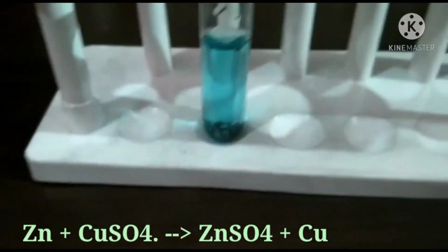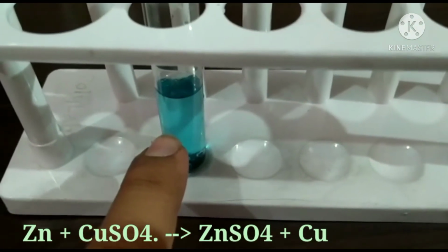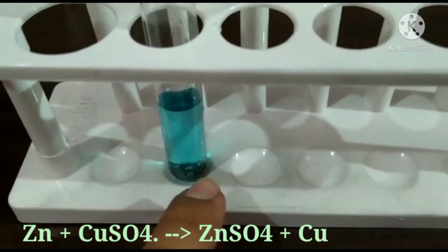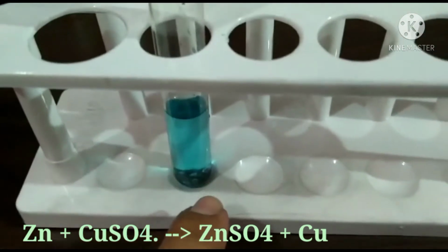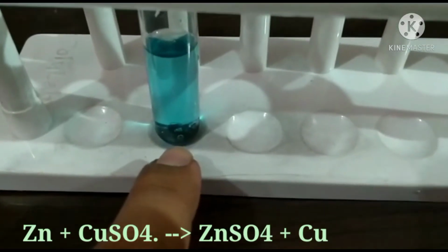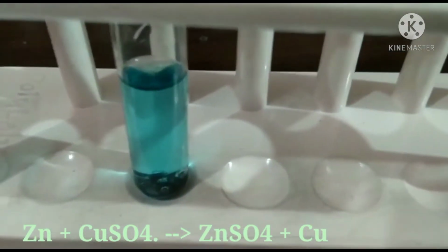This happens because the zinc metal displaces the copper from the copper sulfate solution. So the solution becomes zinc sulfate, which is colorless. Second, the zinc displaces copper, and hence the zinc becomes brownish. This is a displacement reaction.